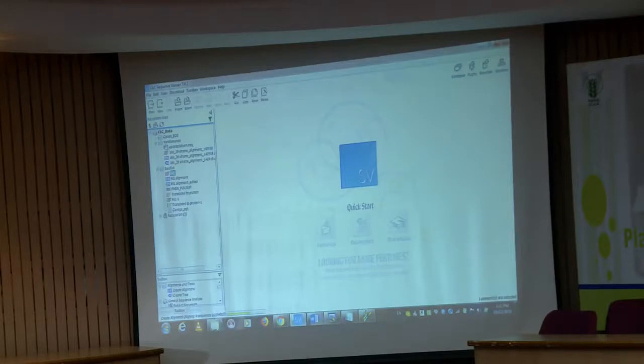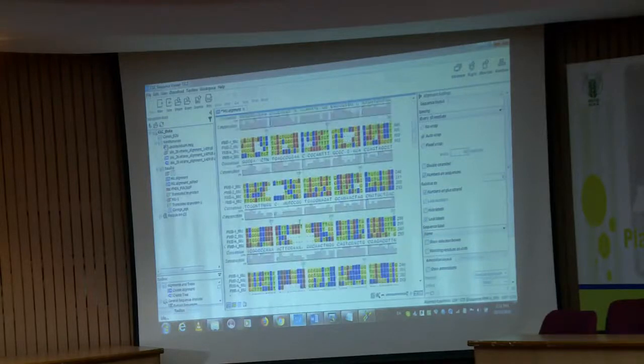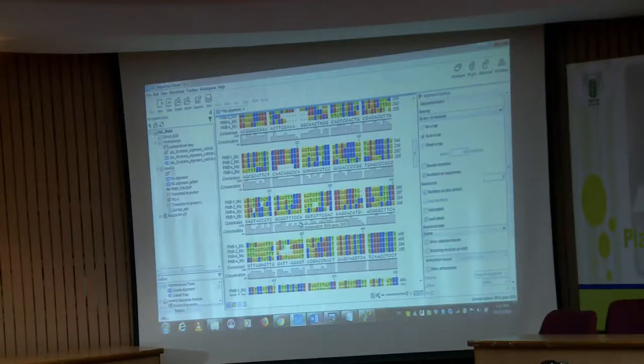So, now you can see at the bottom it is making the alignment. Your files will be aligned somewhat like this, right, because at some point data may not be good in some sequence, it may not read it correctly, it may not align, that is the reason it is showing some gaps somewhere. So, there is no uniform data among all these 4 sequences. These are the 4 samples with one gene, okay. So, 4 samples of data I have imported within a single text file.